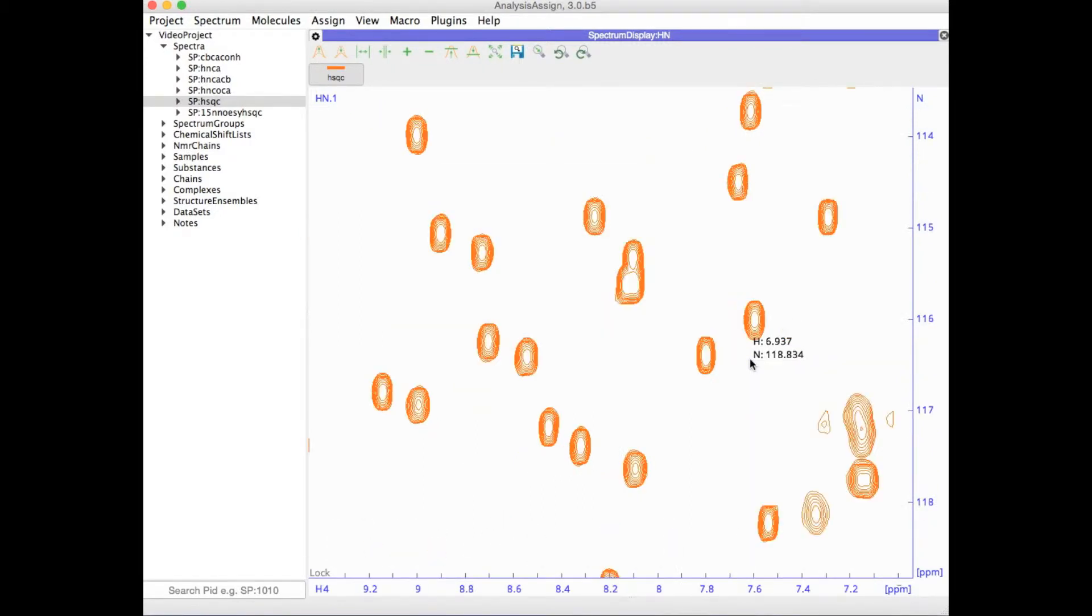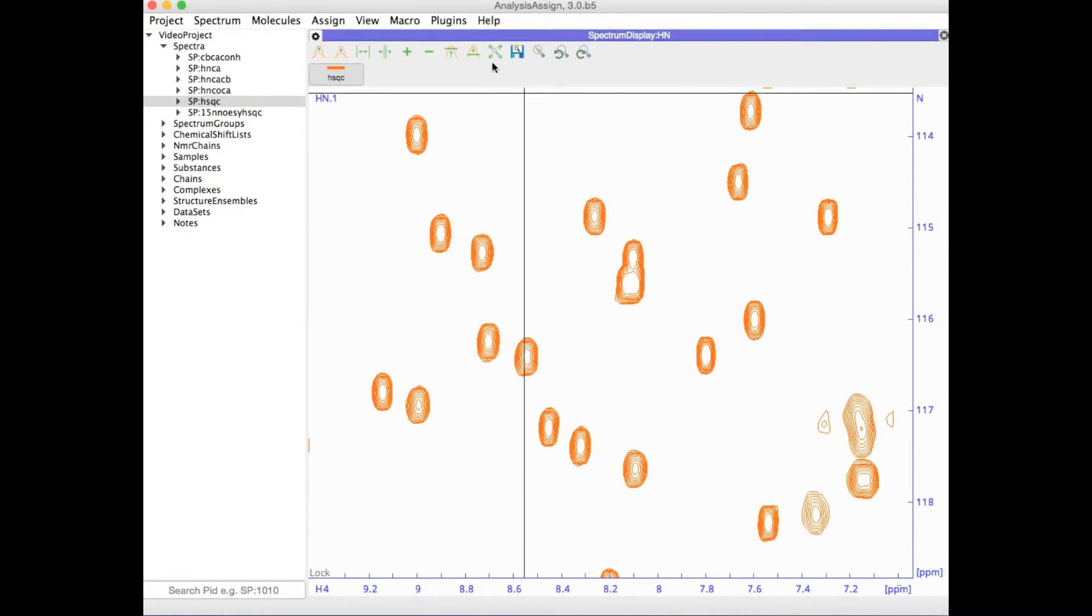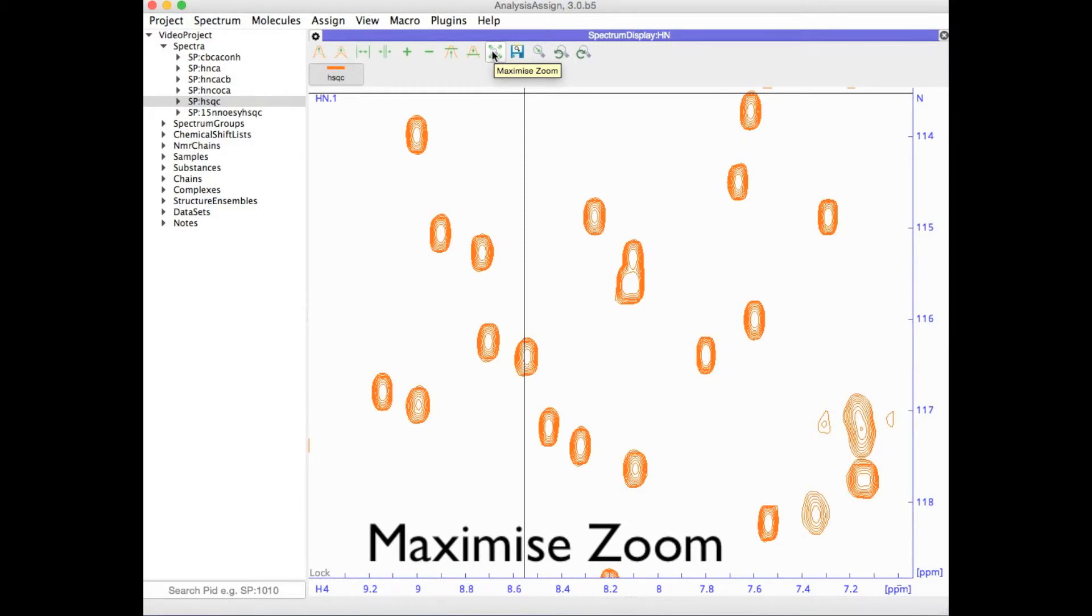If you want to go back to seeing the full spectrum, you can press the maximize zoom button in the toolbar.